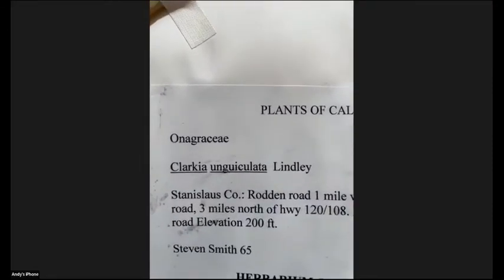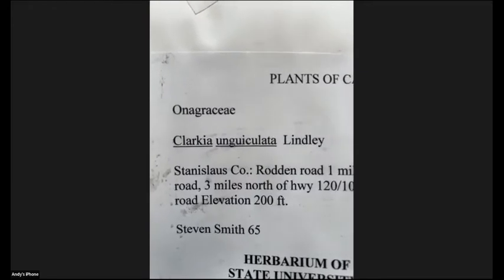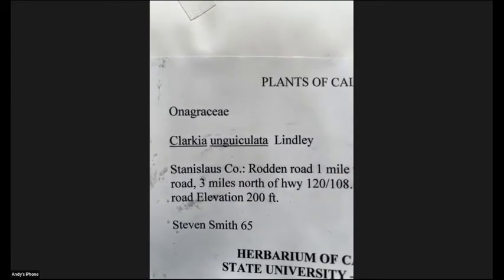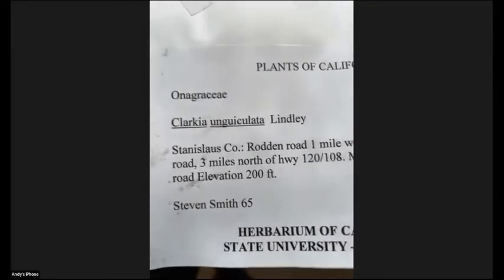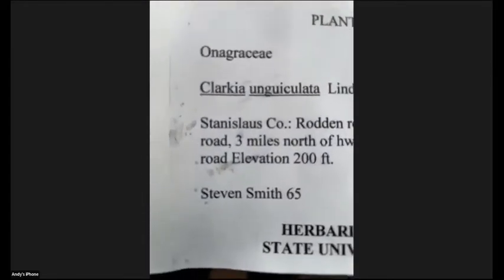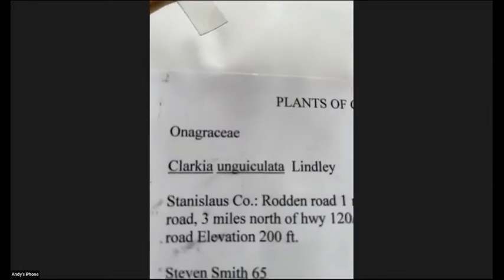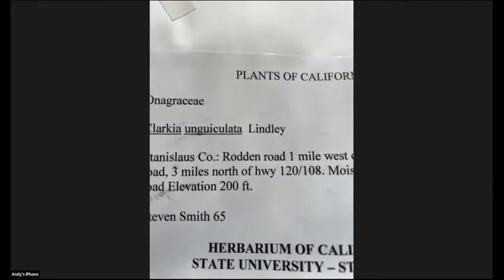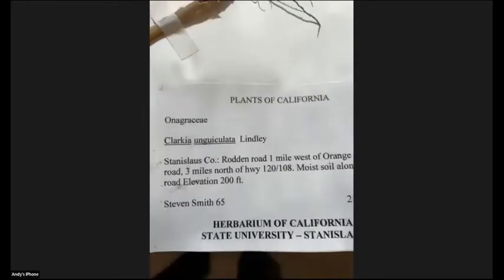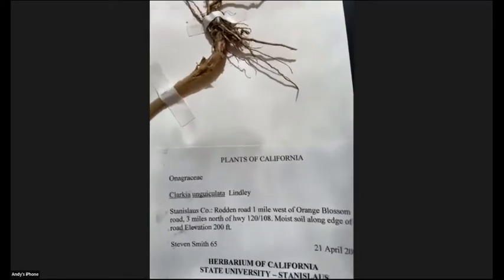This plant is from the plant family Onagraceae, the evening primrose family. And this happens to be Clarkia unguiculata. That's a strange sounding name, unguiculata. Well, that scientific name means elegant, and this is elegant Clarkia. So when was this one collected here? On the 21st of April in 2004.